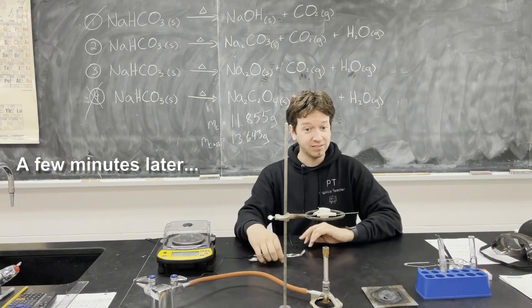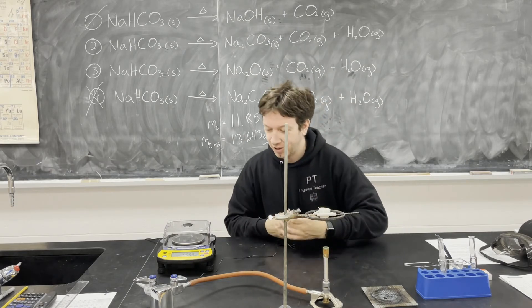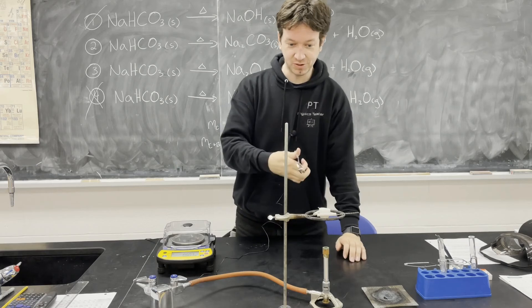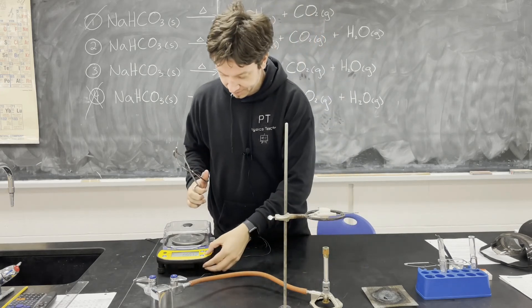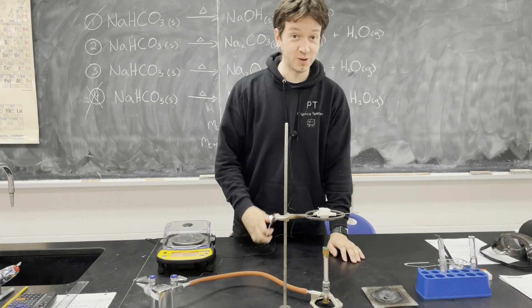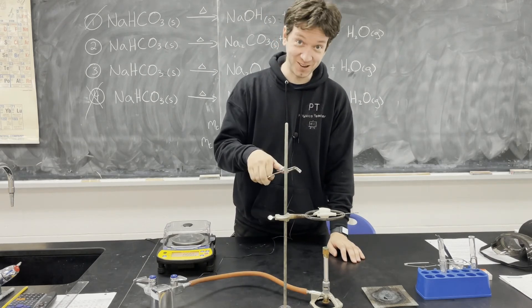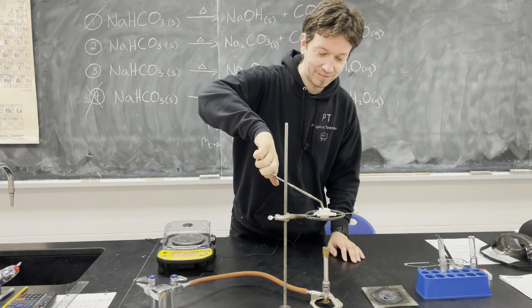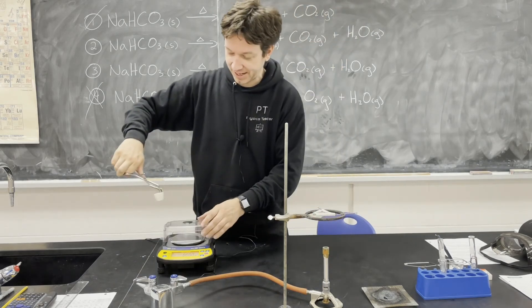All right, now it still could be hot, so don't grab it with your fingers. We're going to use our crucible tongs to grab our crucible. And let's measure its mass.